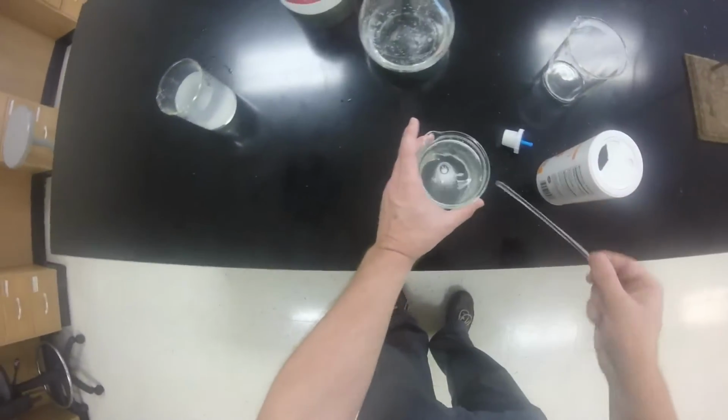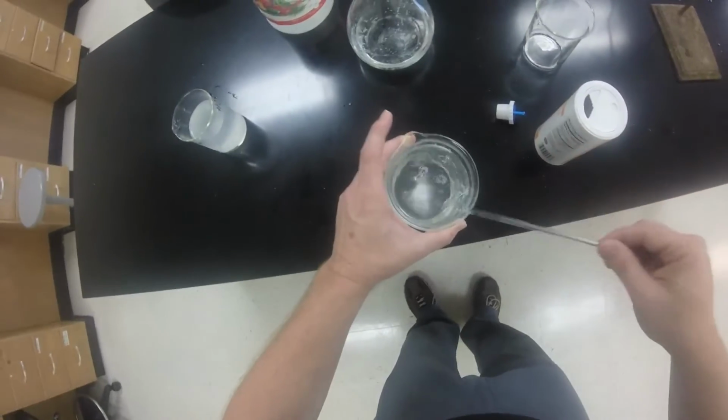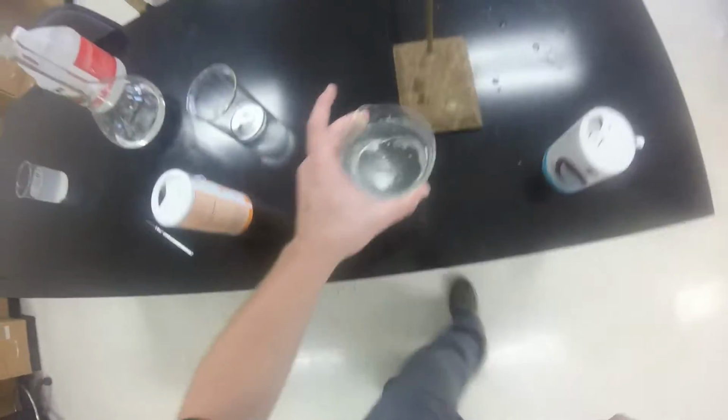So the sugar, when it goes in, it's not going to fall apart or break apart in any way. So really there's not going to be any charge carriers. So the ideal thing to see is our light bulb is going to stay out. So we still have a little down there that haven't dissolved, but let's go ahead and give this a try for our non-electrolyte.